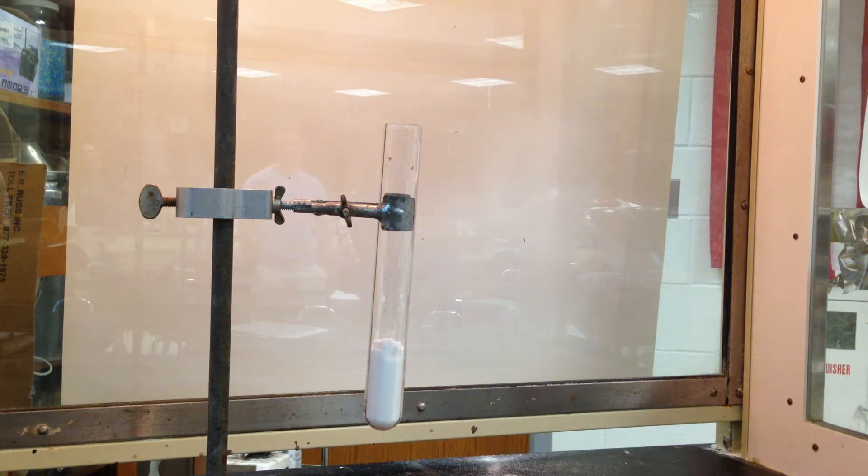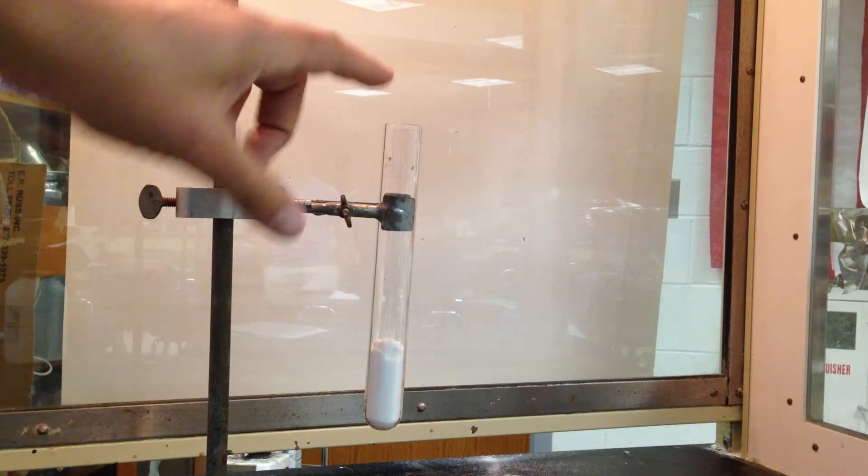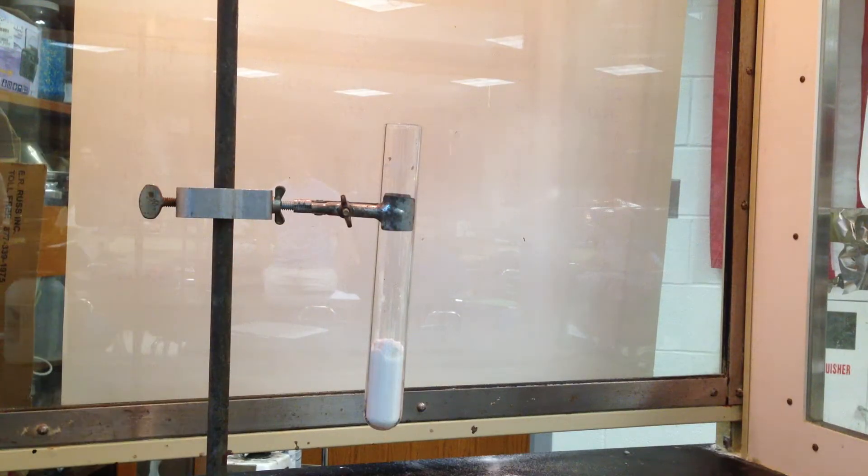So here we have the world-famous gummy bear potassium chlorate demonstration. And what I have in the fire tubes, which are very thick-walled test tubes, is potassium chlorate, KClO3. And as you probably have learned, or will learn, KClO3 is a strong oxidizing agent.